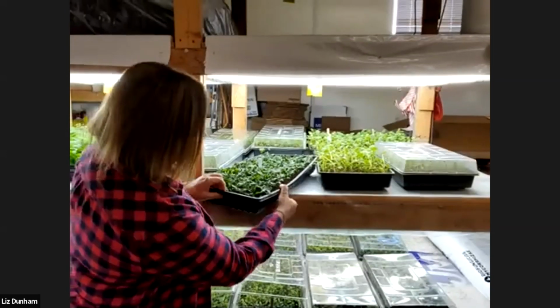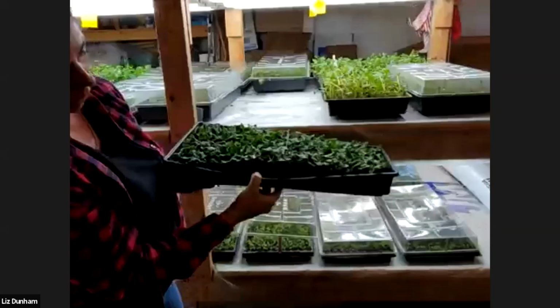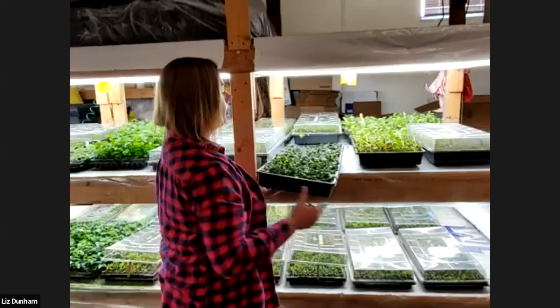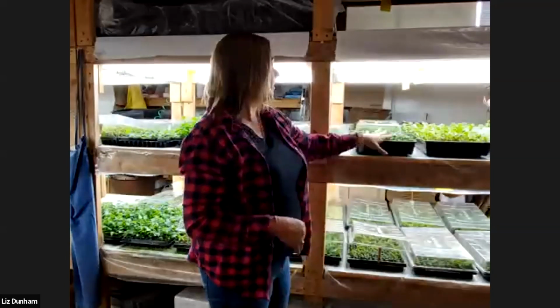These have been hanging out for a while because I needed to generate more. We will do softwood cuttings from this room quite often if we can't get enough from culture as soon as we'd like. Some things we'll do better from softwood cuttings. So we'll generate as many as we can in culture, plant them, and then take cuttings from them in this room. So that's why these have been hanging out for a while.